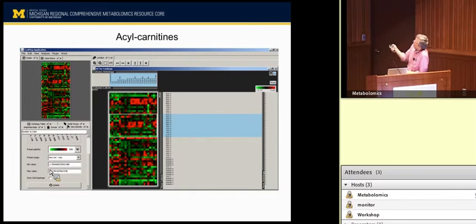If you start looking up and down, you can start seeing the patterns of how these things change. There's a bunch of red here, there's a bunch of red here, and that red goes away in the carbohydrate feeding. These things go up and down in a relatively predictable pattern, so you're starting to do pattern recognition. As Barbara has taught me very well, human beings are visual people, and you can see things that you don't if you just read a bunch of numbers.